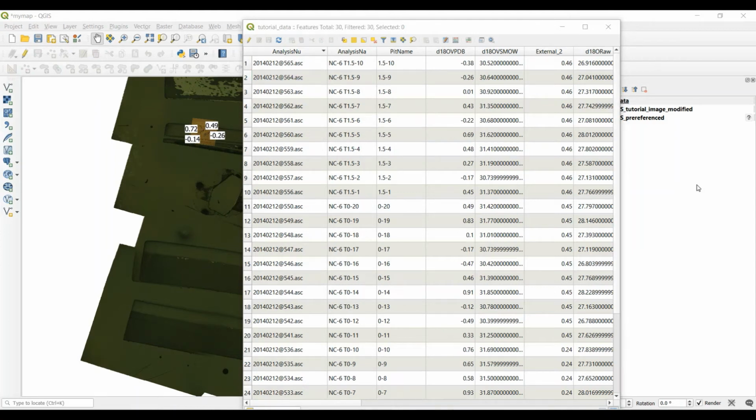In this video, we're going to be talking about watched files and joins. More specifically, we're going to be looking at using them to get around a pretty common problem in microanalytical geochemistry, which is that the data that gets uploaded into a map may not be the finished version of that data. There may be additional corrections or changes that need to be made as things proceed or as you get a better understanding of what you're looking at.